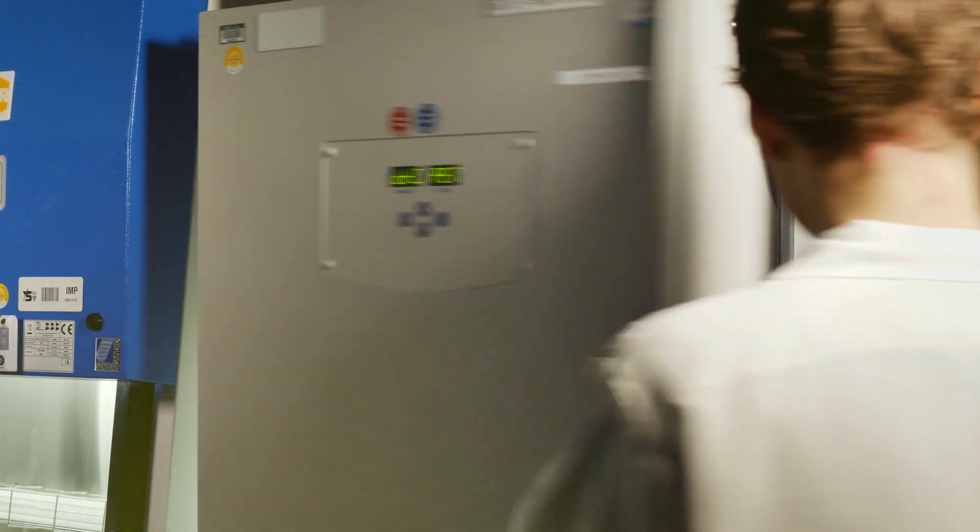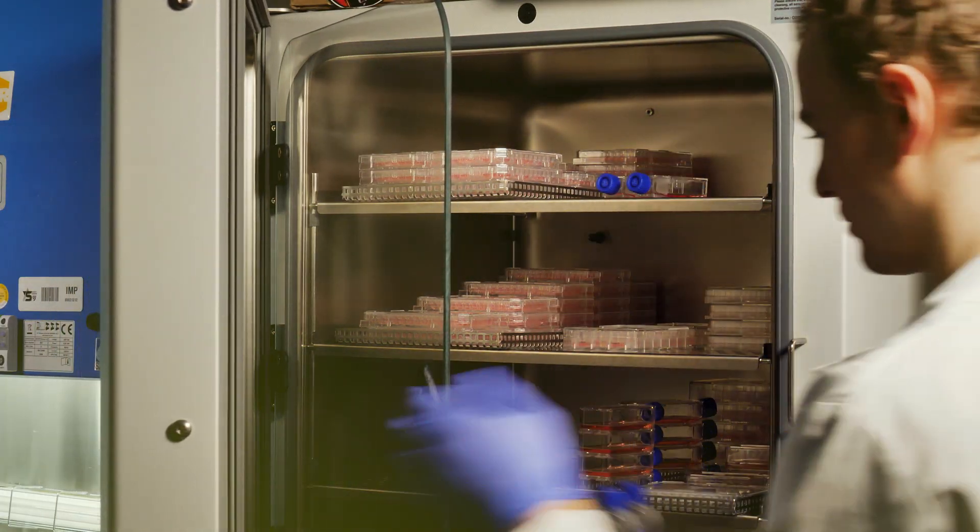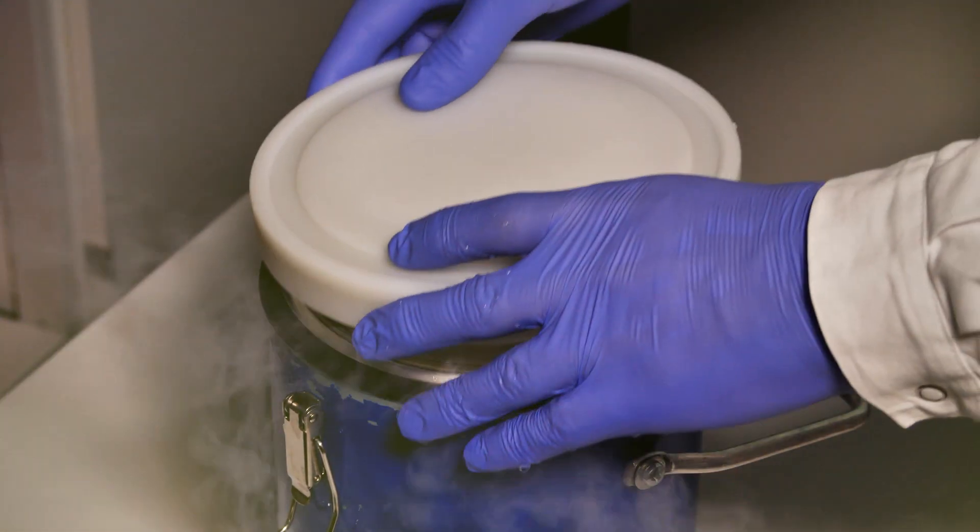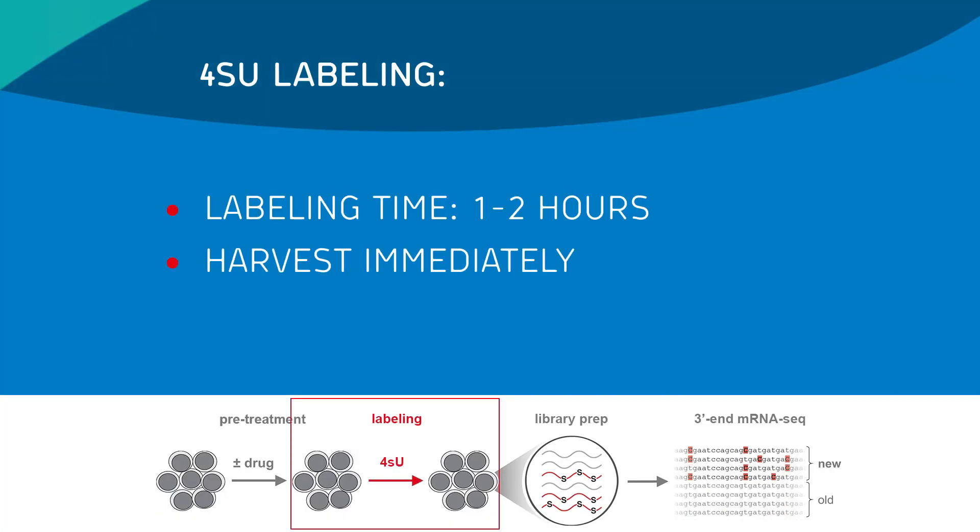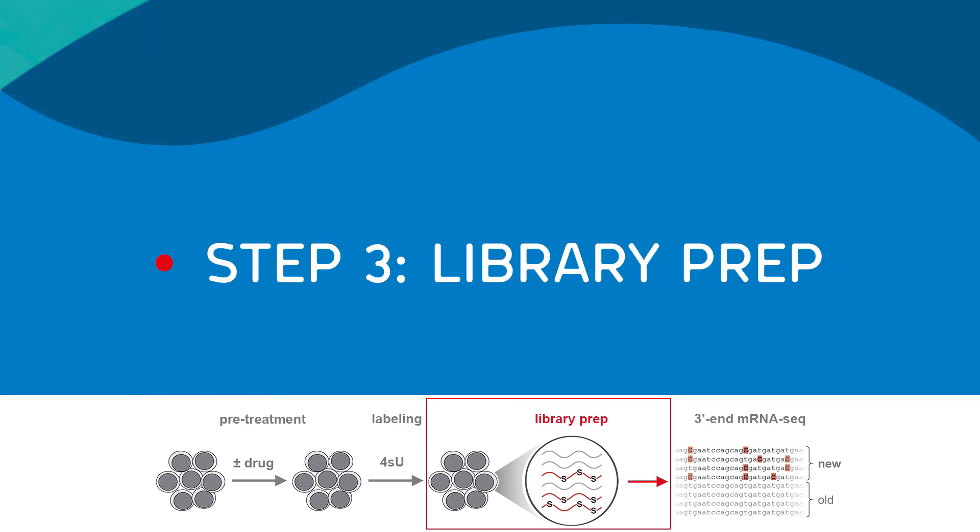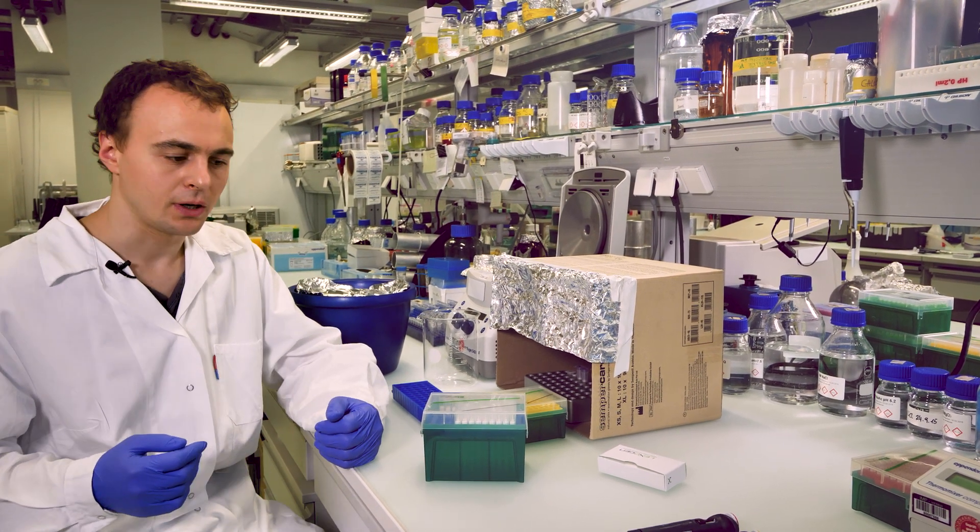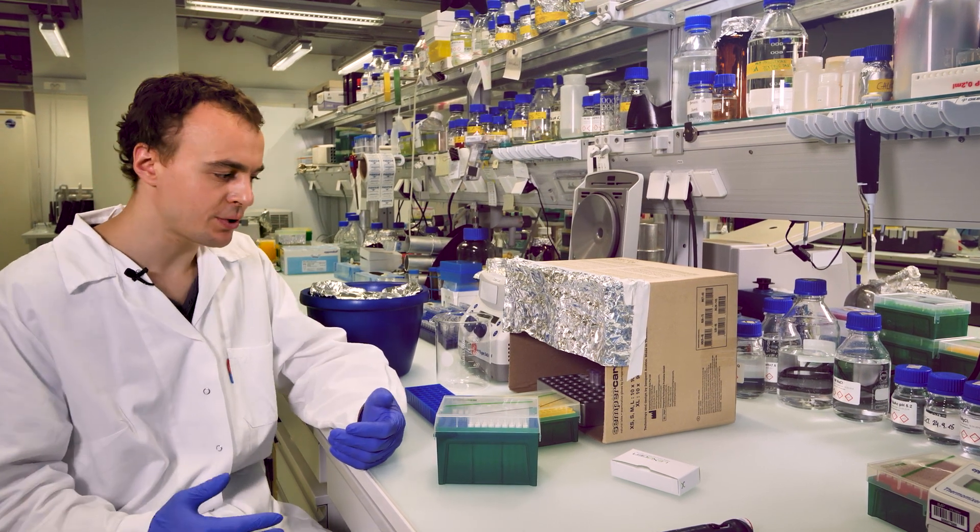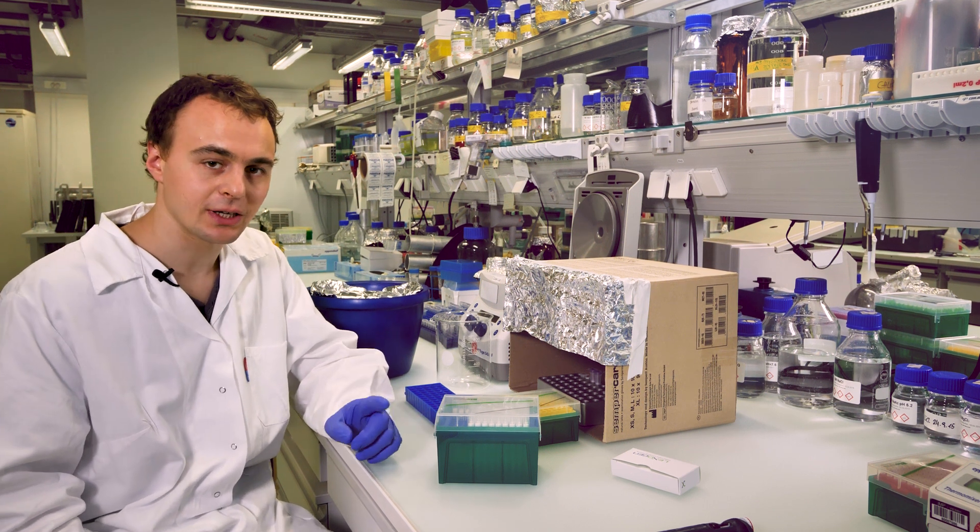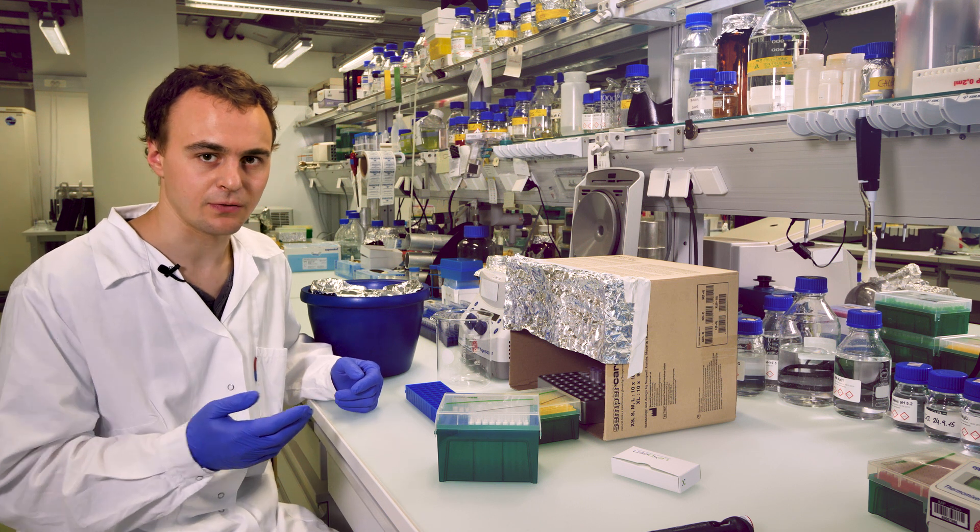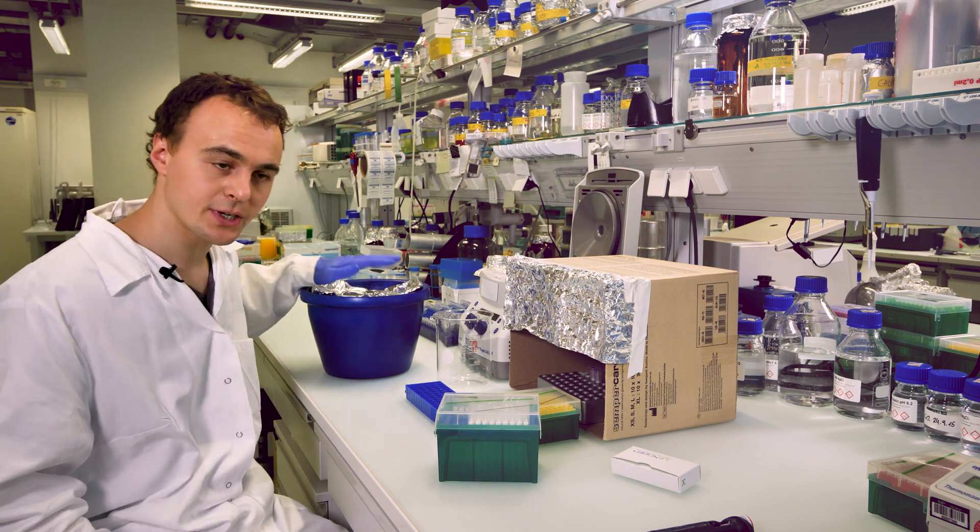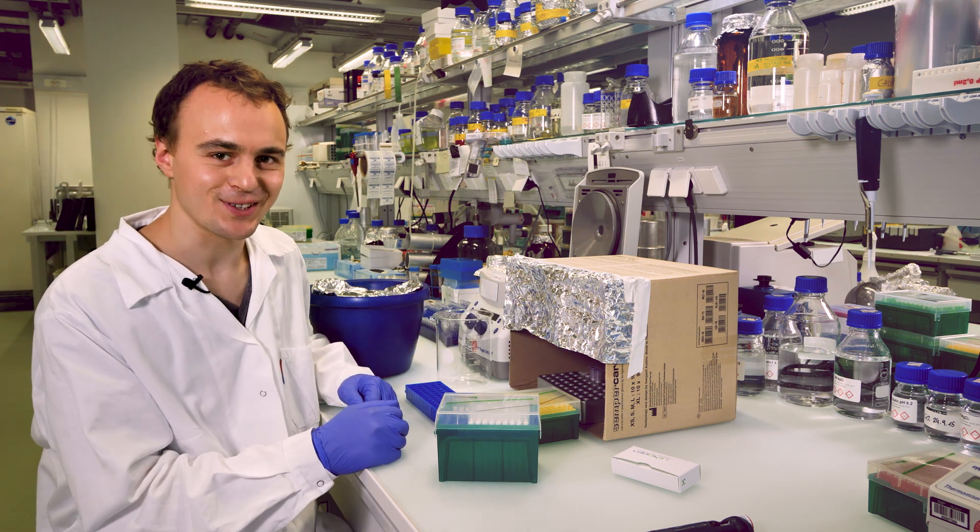Now we only have to harvest our cells and extract the RNA. At this point, it is important to keep the timing precise. And for this, we just snap freeze our cells. Now we perform an RNA extraction with basically any RNA extraction method that you prefer to use in the lab. We personally like to use a commercial column purification kit. The one thing that is important to note is that our samples are still light sensitive. So we have to protect it from direct light on the one hand by covering our samples and wherever possible, we also shield it with constructions like these.